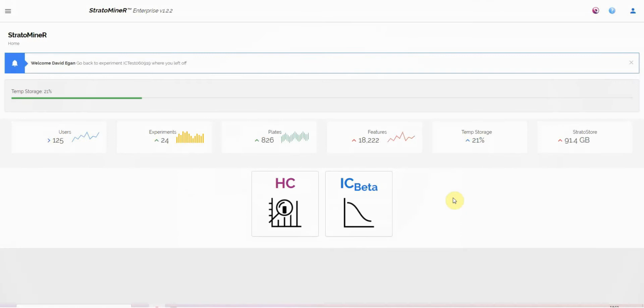This is David Egan from Corelef Analytics, and this is just a quick video to show you how to use our IC StratoMineR curve fitting software. Now, this is not a complete solution, but a number of customers have already been finding it useful, so we just want to show you how to use this.